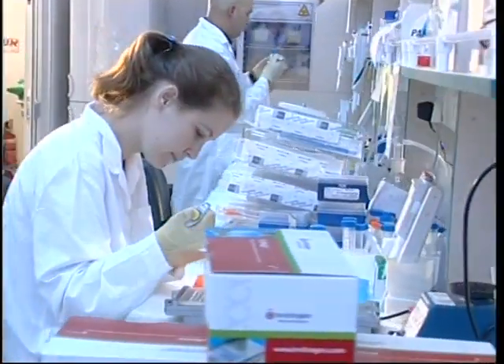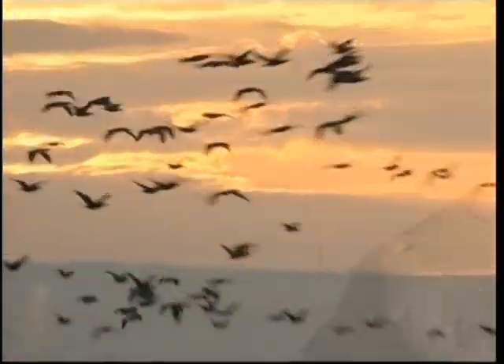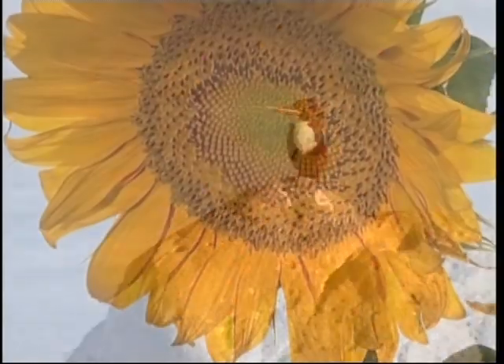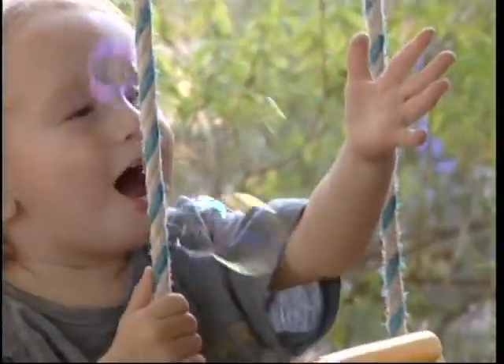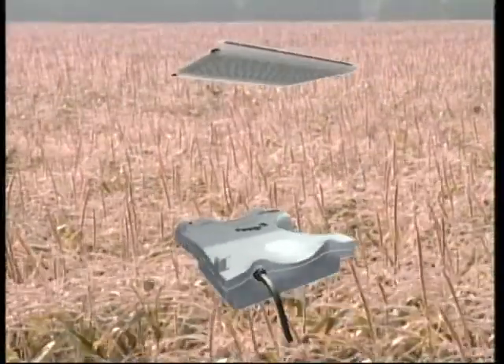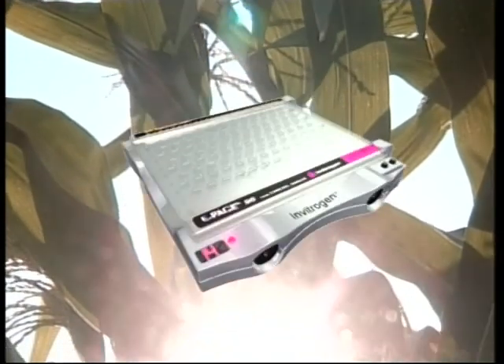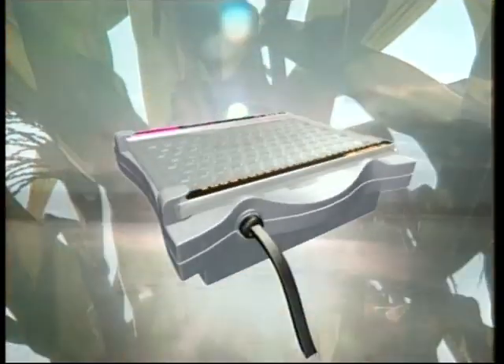Forget all about casting gels, running buffers and power supplies, and look at ePage — the first truly load-and-run protein electrophoresis system. So when you explore your proteins, either in the individual research lab or in the industrial screening facility, Invitrogen's ePage system is here to answer your needs.